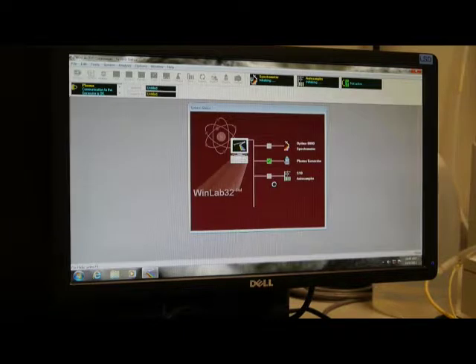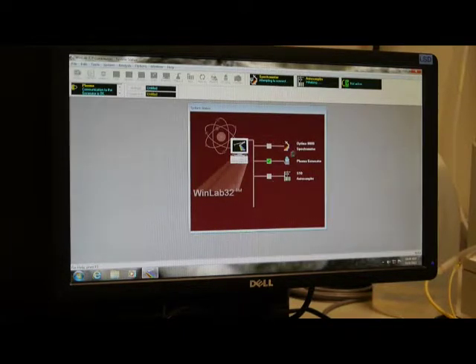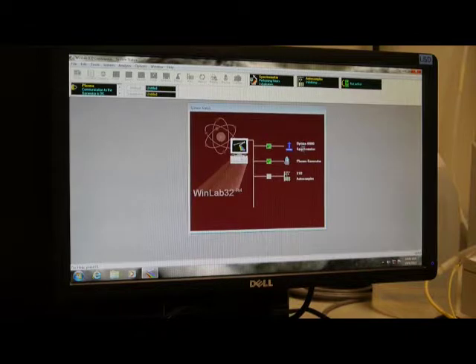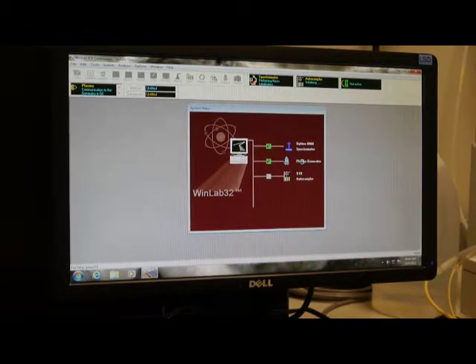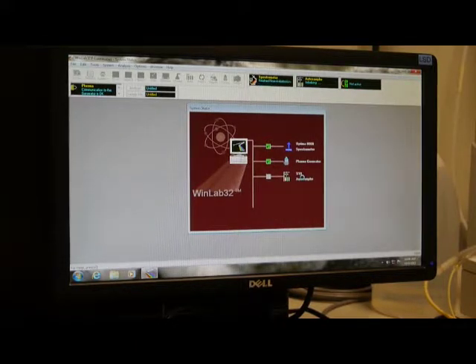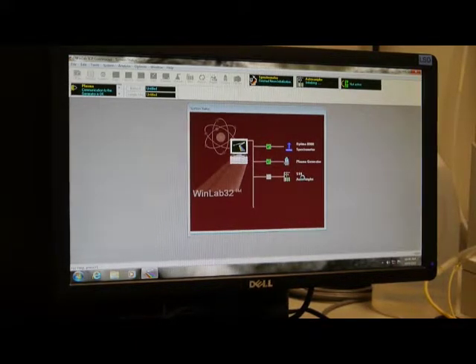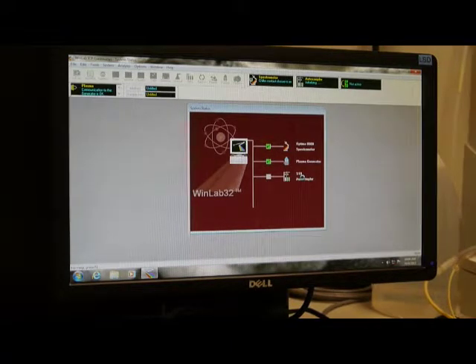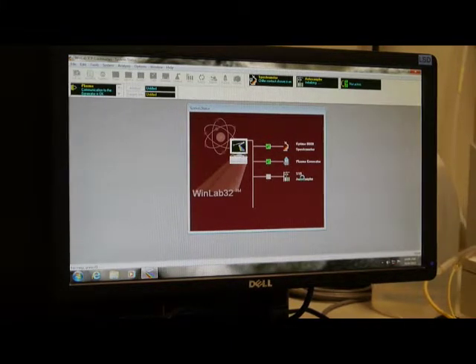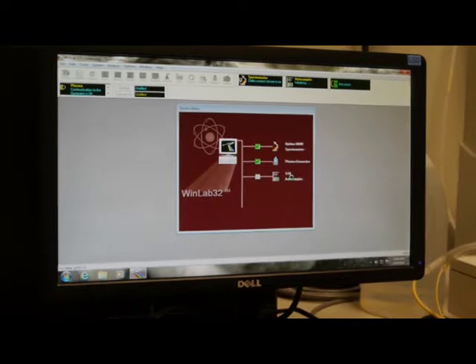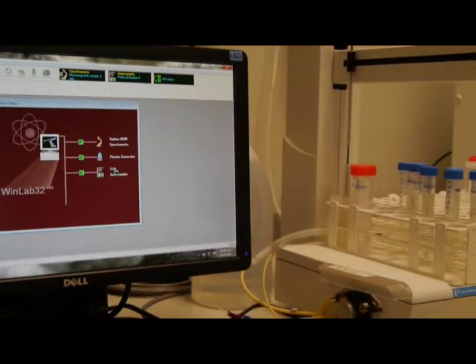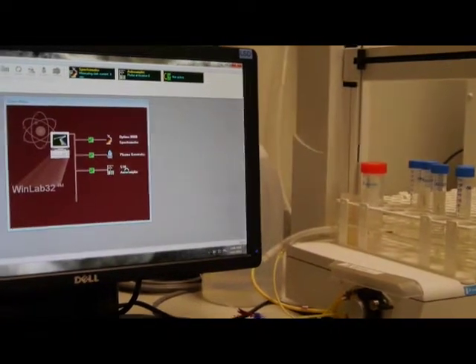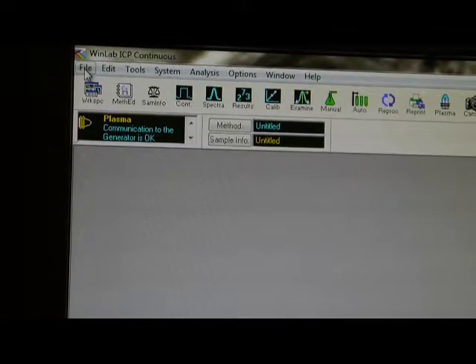Now the software will check the status for your spectrometer, the plasma generator, and the auto sampler. Once the machine has done the self check, the window will disappear and now you can start to load the method.